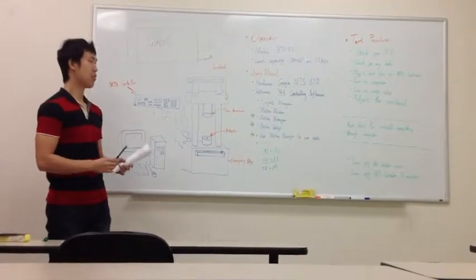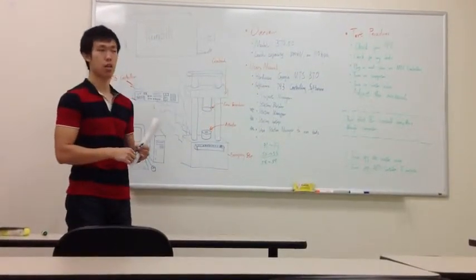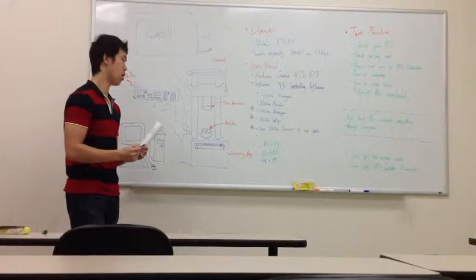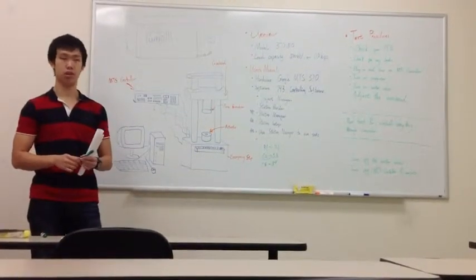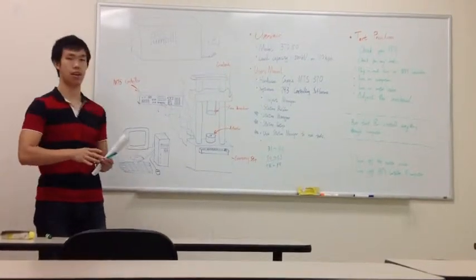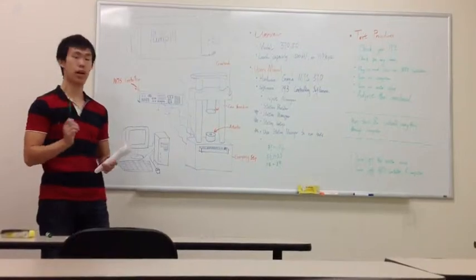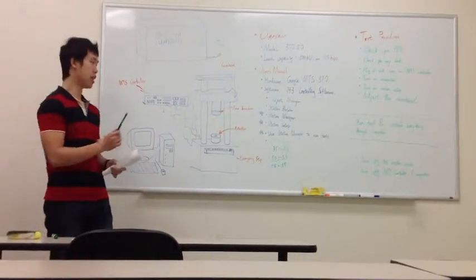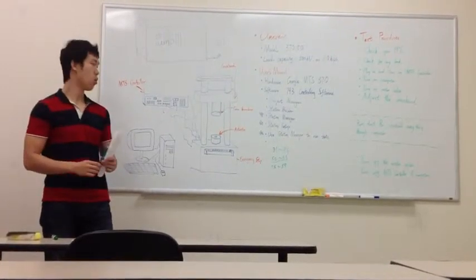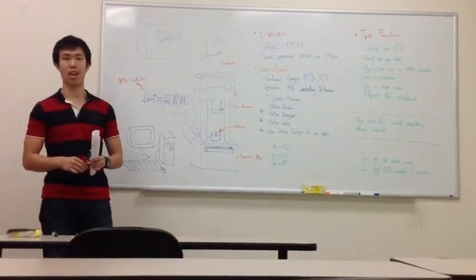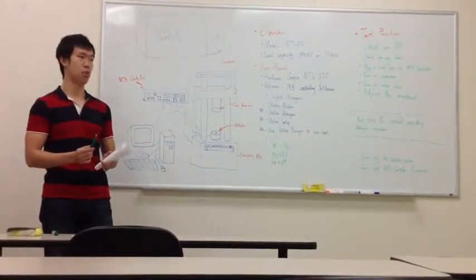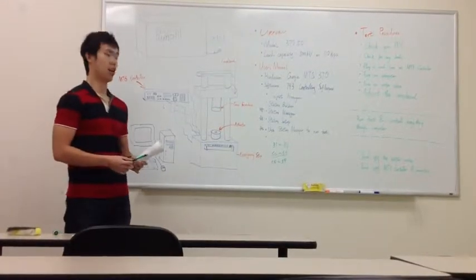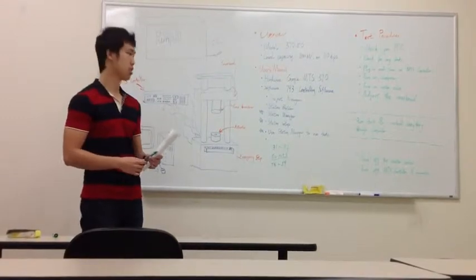So after all the adjustments and checks, you can start to run your test. Once you start your test, you control everything on your computer through these softwares instead of changing anything manually. There's one exception is the emergency stop button. So for this MTS, you have two emergency stop buttons. One is on the load frame and one is on the pump. Just in case something bad happens, you will need to press the emergency stop button right away to interrupt the test. That is to prevent some further damages.